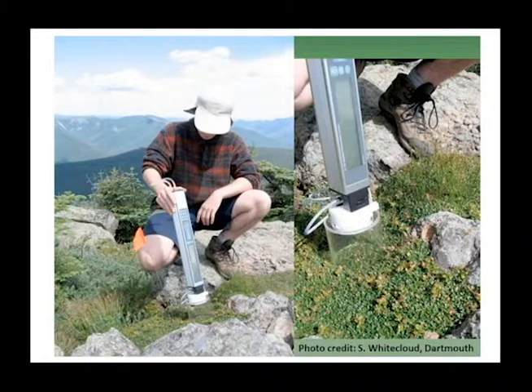So she purchased this piece from CID Bioscience, and then her school fitted a chamber for her out of clear materials so that light can come through and photosynthesis will occur. And this allows her to study these really low-lying carpet plants where she's not able to actually measure the photosynthesis rate on a single leaf because they are so small. So this was her way of getting around that.